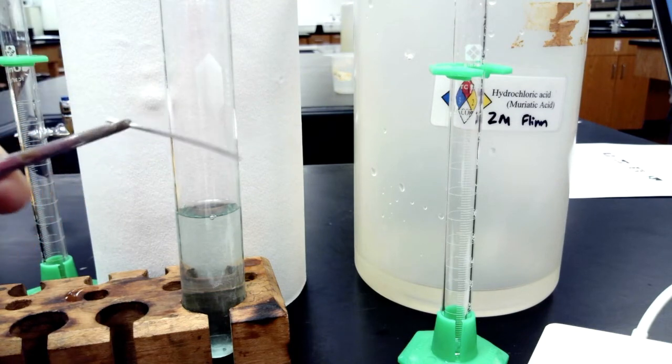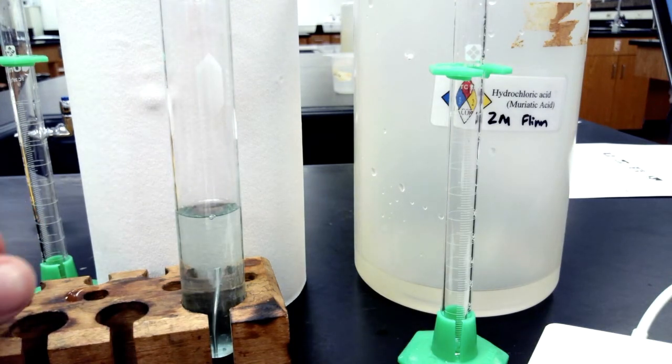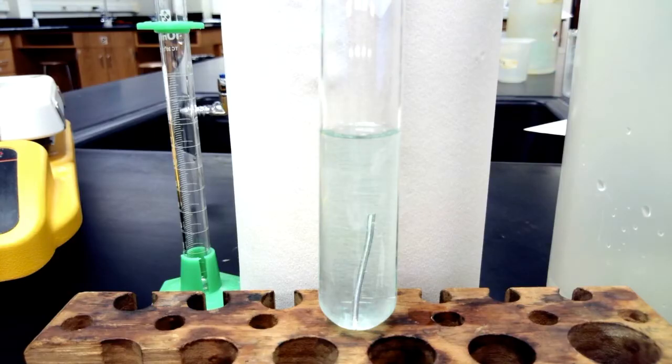Now step 6 is to place an aluminum wire into the solution. There are actually 2 observations and 2 reactions here for part 6 and part 7. For part 6, there are 2 reactions happening. The aluminum is reacting with the copper chloride to form copper metal. This is a very slow reaction, so you see like nothing's really happening here. This is over about the course of 15 minutes. In the next couple videos, you can see some brown chunks there, because every few minutes I took a short video of this.